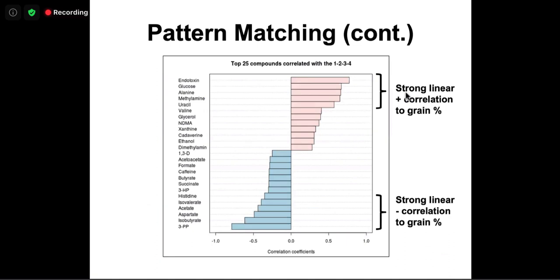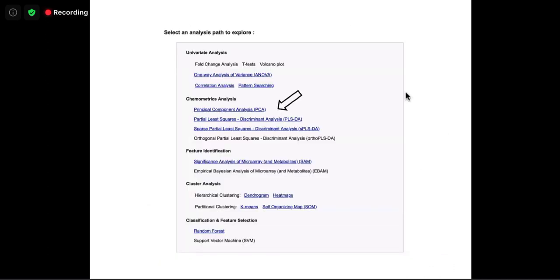If you specify the pattern like that, the result looks like this, with correlation bars. At the top it's positive correlation, orange. At the bottom it's bluish, so it's negative correlation. So there is a strong positive correlation and a strong negative correlation at the end, which is basically for you to develop your stories.